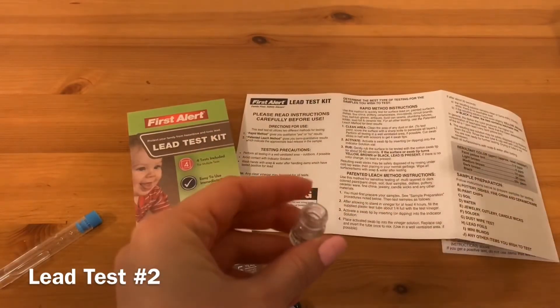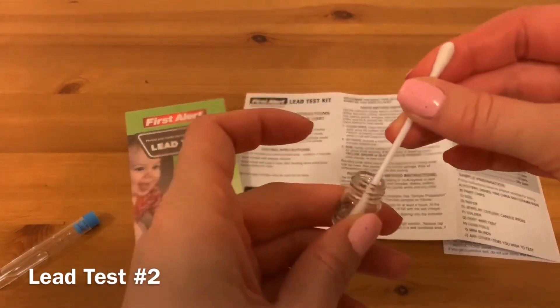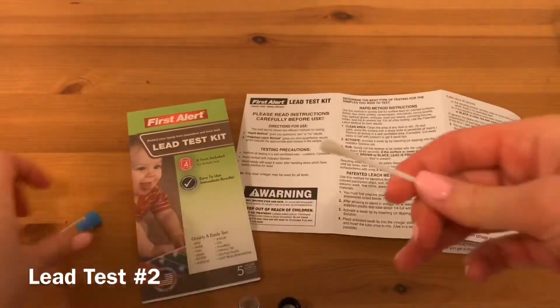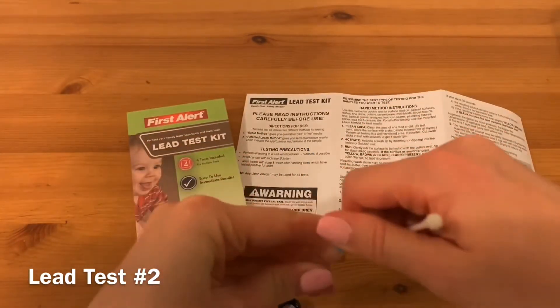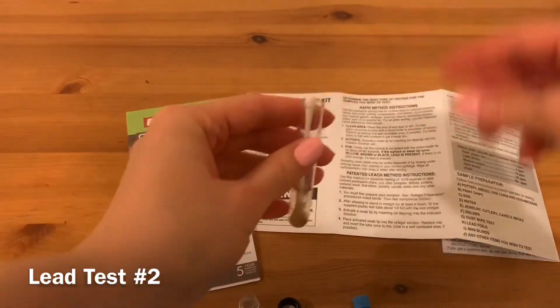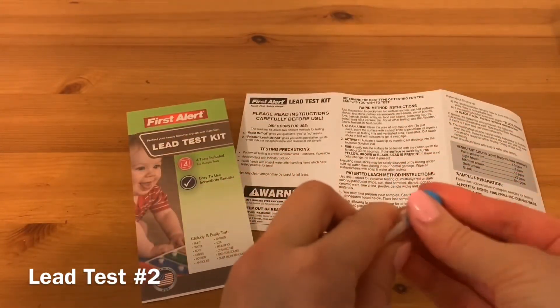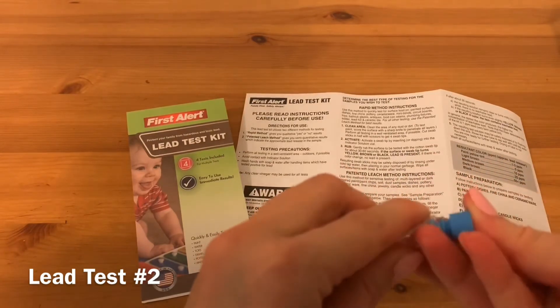Activate the swab tip by inserting it into the indicator solution. Place the activated swab tip into the vinegar solution. Replace the cap and invert the tube once to mix.